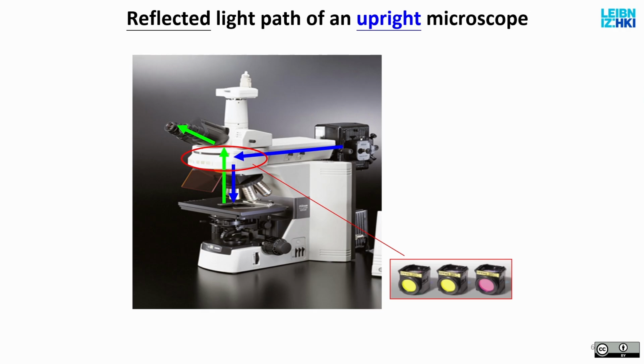Many of you mentioned the mounting thread here. Yeah, it is correct. These filters can be changed, so you can unmount either the excitation or the emission filter and build your own cube without having to buy the metal part again and again and again. Otherwise, these guys basically just pop in.